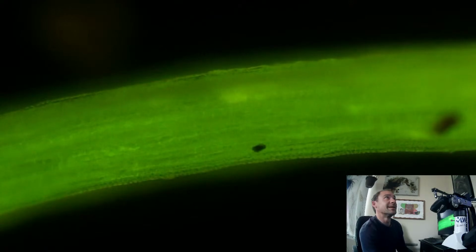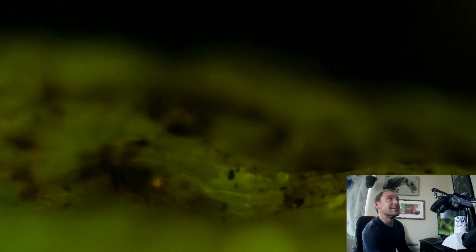So this whole part is oozing and squished a little bit, which seems to make it glow very brightly when it gets squished. But yeah, let's see. Do we have a segment coming off of there? Nope.